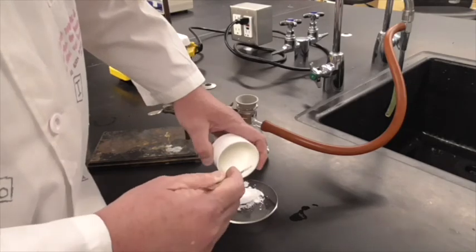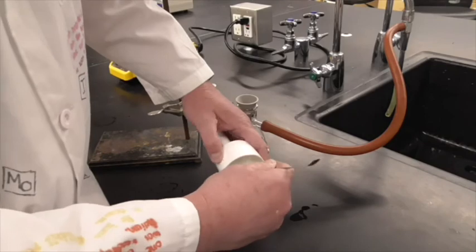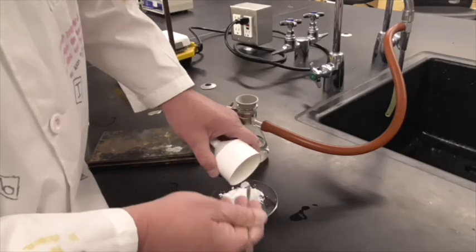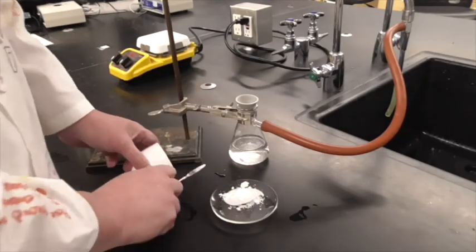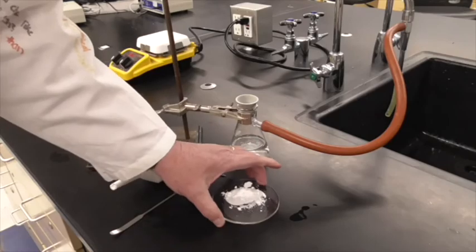So that's why I weighed the watch glass, because I didn't think I was going to be able to get the filter out of there without making a mess with the aspirin. And I was right. So now we're going to let this dry. We'll let it dry overnight, and then we'll come back and weigh the watch glass with the filter and the aspirin on it.